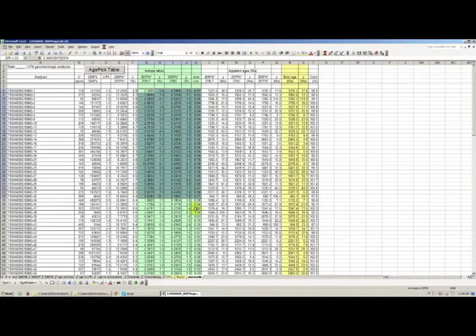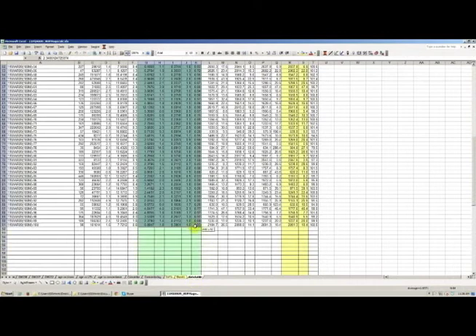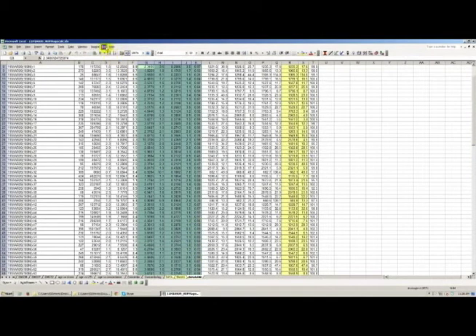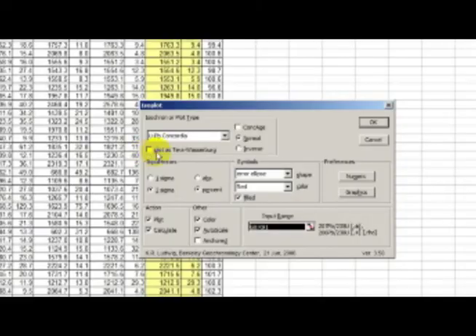In order to do this, we're going to use Isoplot again. So you want to take the columns that you want to plot, just highlight them all. Right. So you go here to the upper ribbon and click on the Isoplot icon again. It opens Isoplot, and in this case, Isoplot already identified that you're going to plot a uranium-lead Concordia. The input errors in this case are 1 sigma, and they are in percent. So we want to plot, and we don't want to calculate because this is a detrital sample, so we're going to have several different age populations, and it's not a single age that we can calculate.